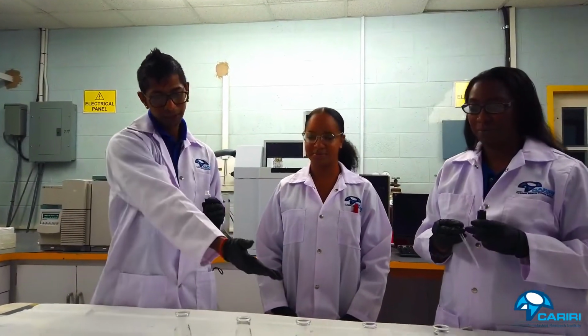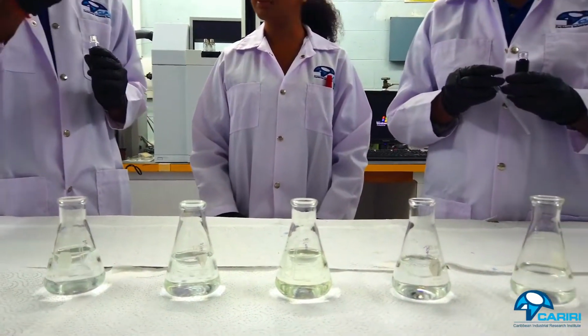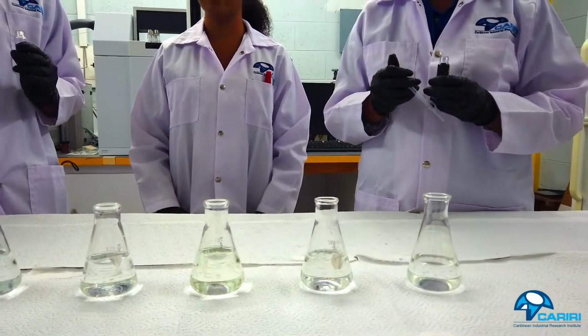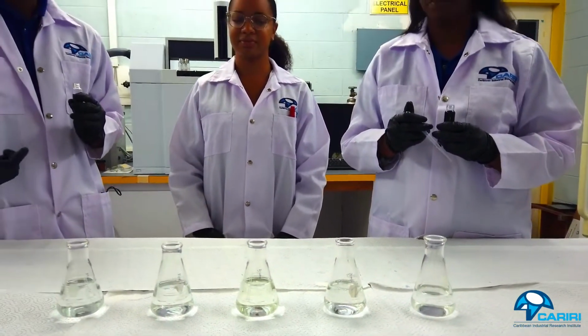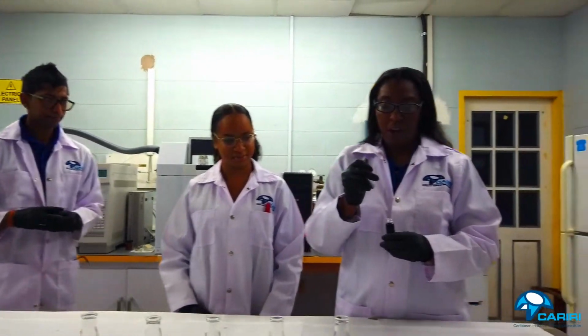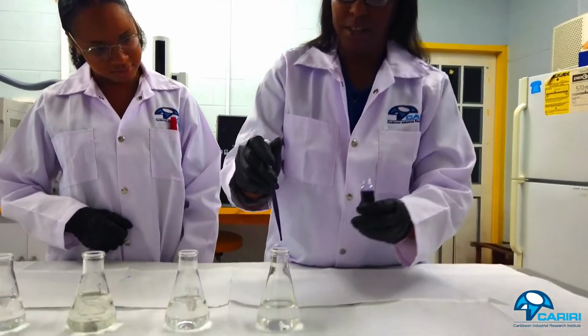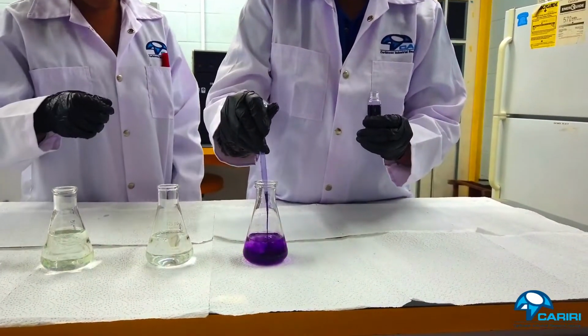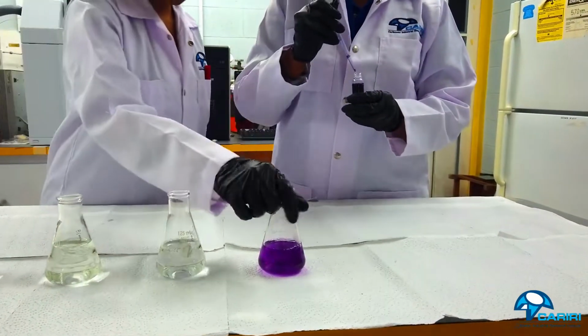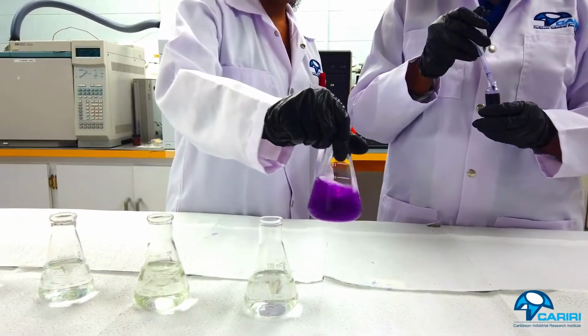So we have 5 solutions lined up in front of you here. And with these 5 solutions, we are going to demonstrate the interaction between the indicator and the solution. And we should see some difference in it. So let's do this. Alright, so we're going to add a few drops to this first conical flask. First one, I'm just going to swirl that to make sure it mixes properly.